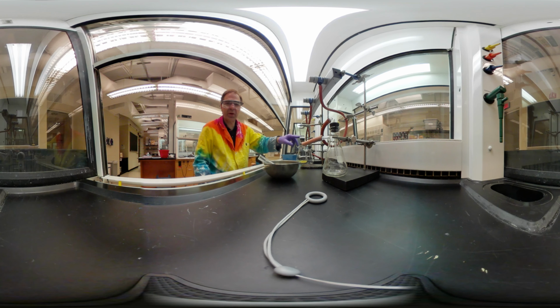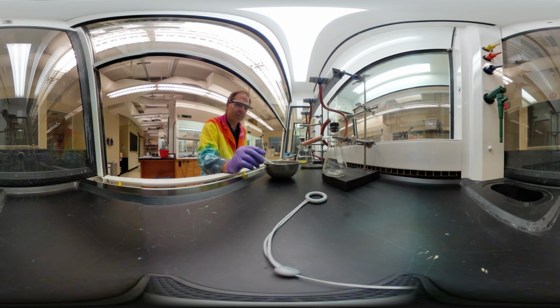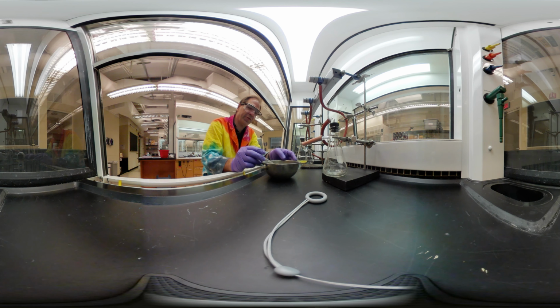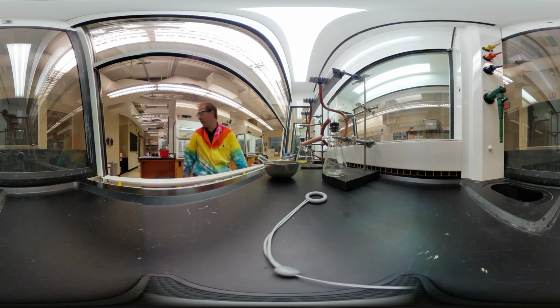Now I put a new filter on here because our product is the solid, and I'm actually going to let this sit just a moment more because I want to have as much product as I can because I want my luminol to really, really work. In fact, let's grab a little more ice.